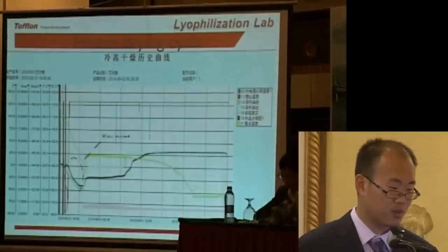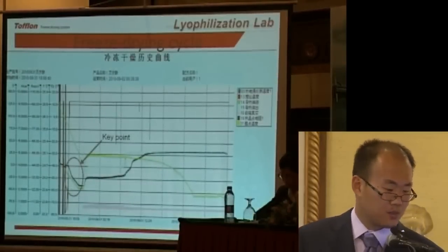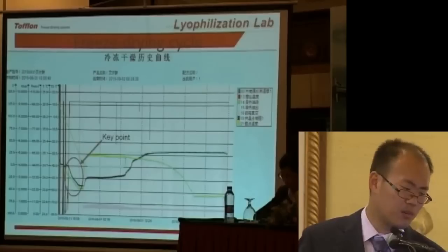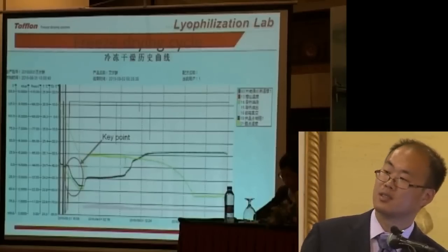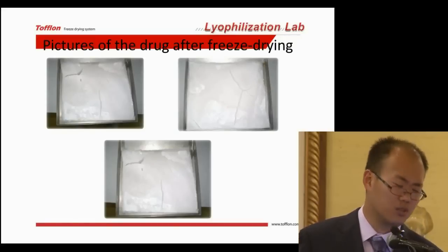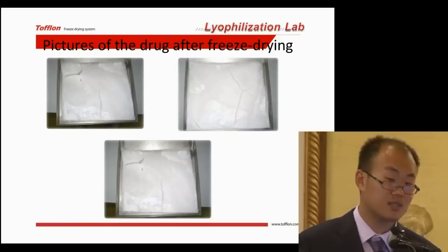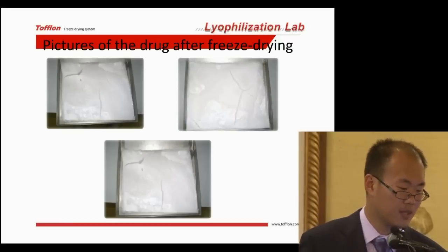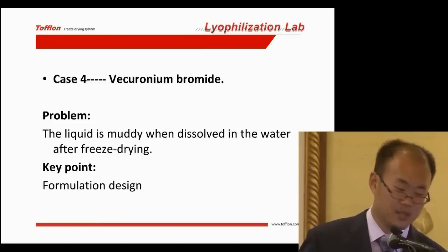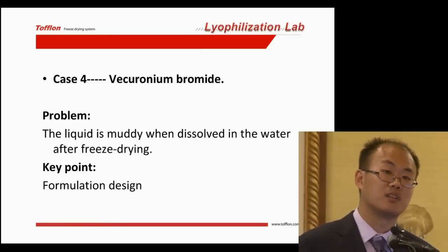And this is the report. Now we deal with this problem through the method of slow cooling. This is the key point. We're cooling very slowly. Now these are three pictures of the product. Slow cooling may give us a very good structure of the product.